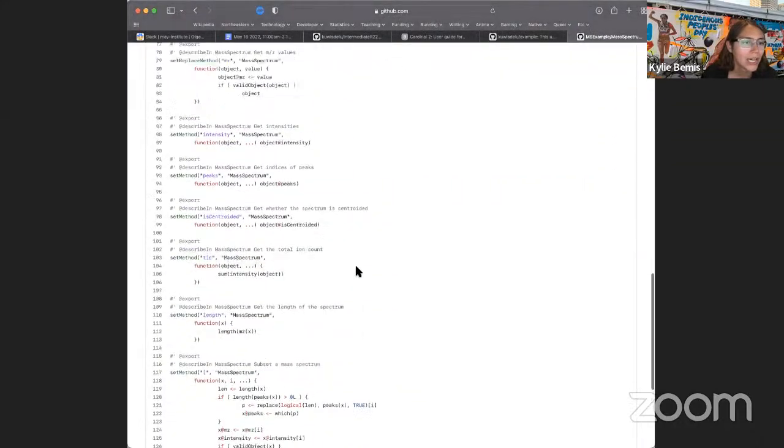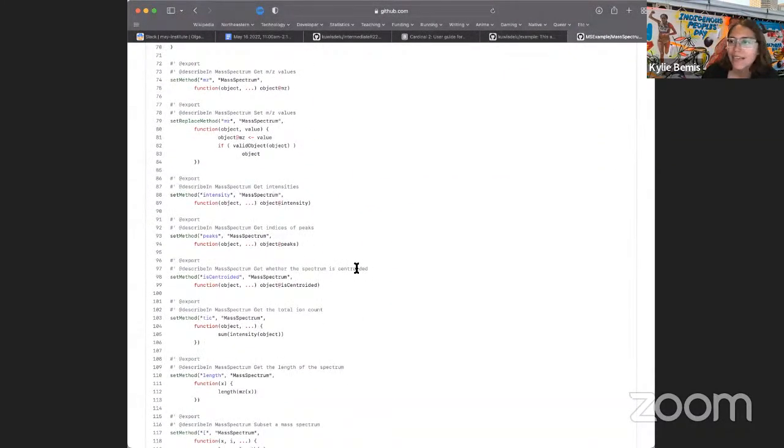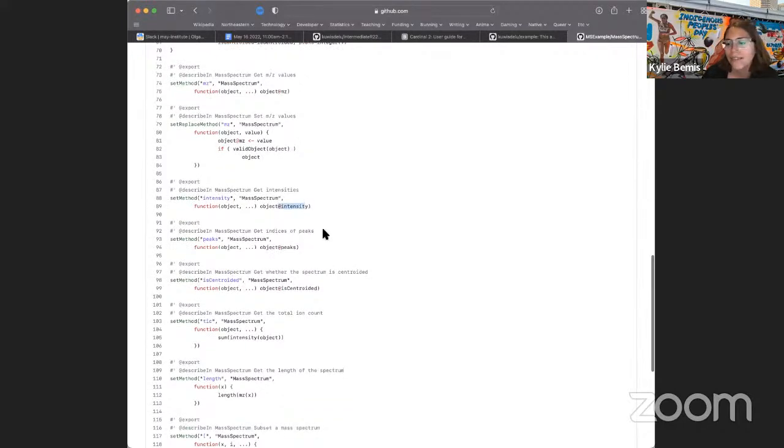That's one kind of common mistake that I see when people first start using S4 classes, which again are everywhere on Bioconductor, is to try to access the slots directly using this @ symbol. But you shouldn't do that because if the internal structure of that code changes, it can break your code. Whereas, ideally, if you're using the accessor functions, then these will be updated so that they continue to work.